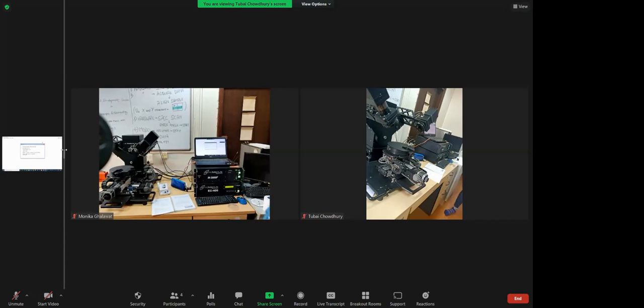And in the graph windows, you can see they are all fitted well, and whatever graph you want to choose, you can go for it. Like if you want to choose psi, you can choose psi by right clicking. You can go to type and choose psi, delta, n, k. There are so many parameters. Whatever you want to plot, you can plot, and you can plot two y-axes together. Okay, so these are the simple steps.